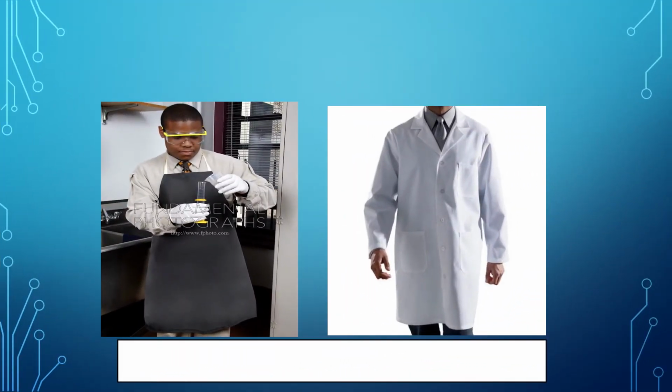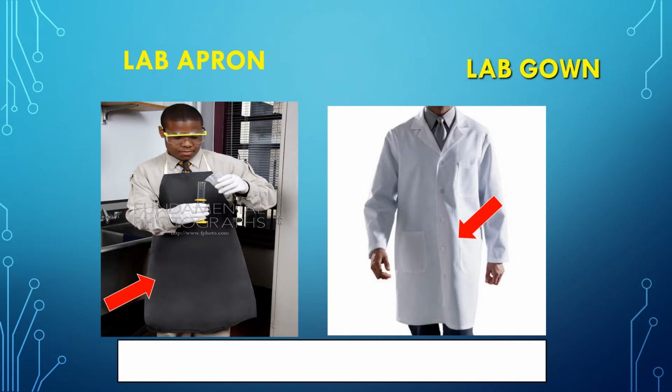What about this one? What is the name of this? First, let us see this one, the black color. Usually in your home, you are using this when you are cooking. We call it apron. But in science, we call it laboratory apron. What about this one, the white color? It is called laboratory gown.